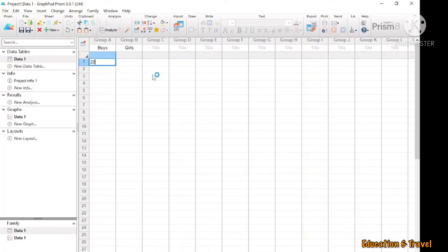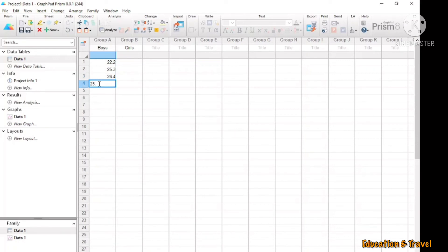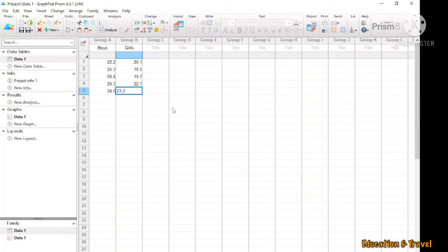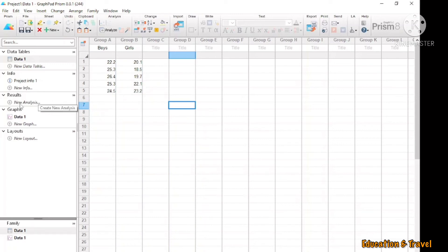Here I am just putting in the BMI values for boys and girls. I am using just five samples. If you need more samples, you can add them here. After putting in the samples, you just need to click here.